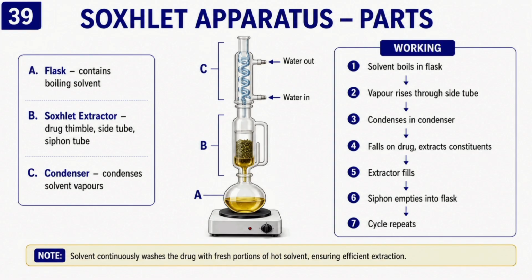Remember, flask boils, condenser cools, and extractor extracts. Siphon returns. So this one sentence can help you remember the entire apparatus.